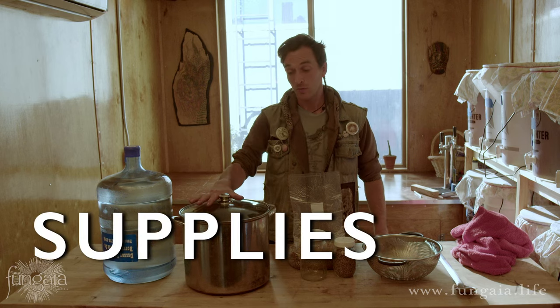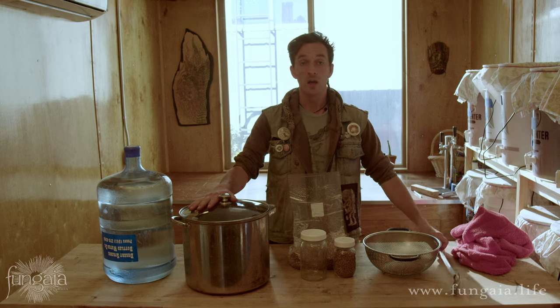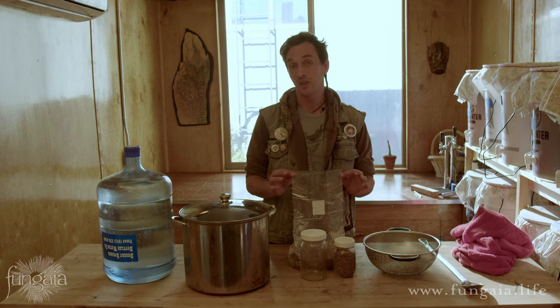You'll need a few other things: a large cooking pot, a pasta strainer or colander to strain the grain, and a long-handled spoon that lets you stir all the way to the bottom. The most important thing you're going to need is your mushroom cultivation vessel.